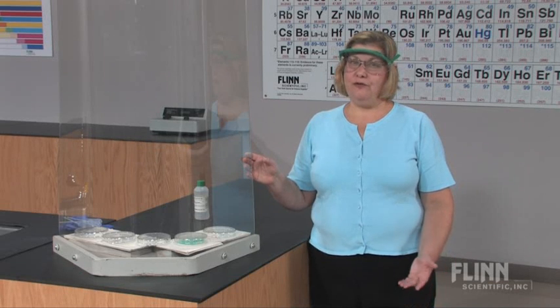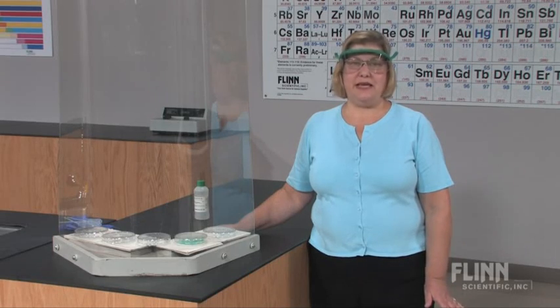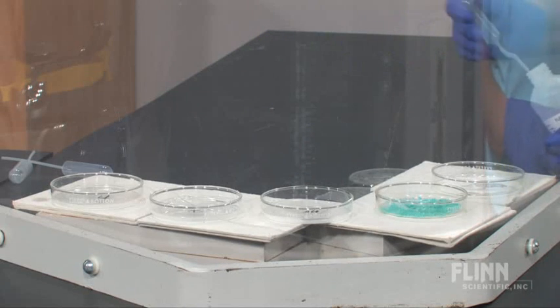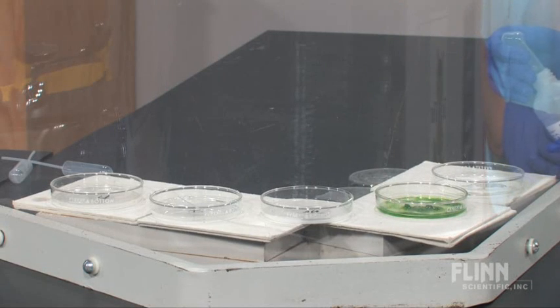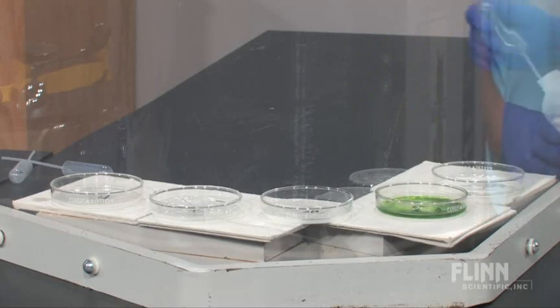Do the demonstration in a well-ventilated lab with a safety shield. For your safety and that of your students, please remember the following four vital safety precautions. First, dispense methyl alcohol in small amounts only in borosilicate glass petri dishes containing various metal salts. Do not use watch glasses or evaporating dishes, and make sure the petri dishes are clearly marked as borosilicate.